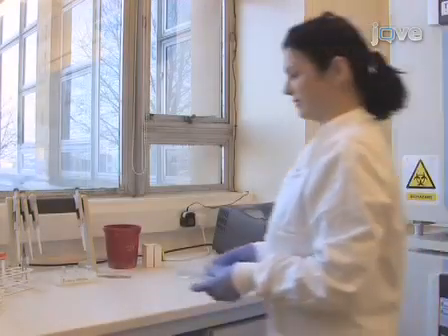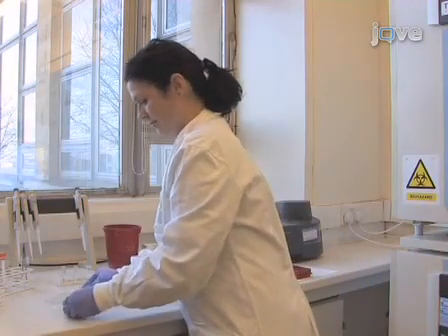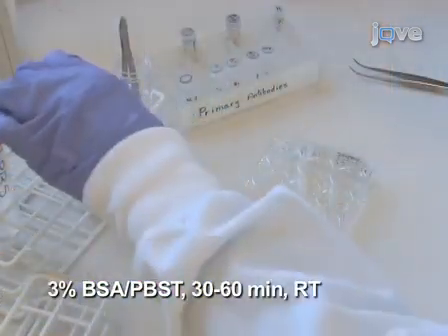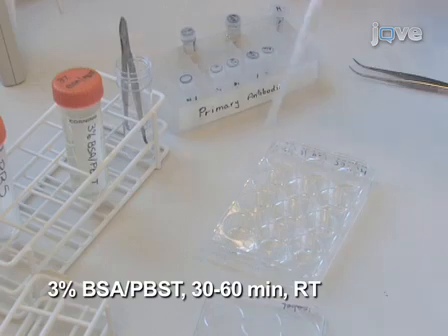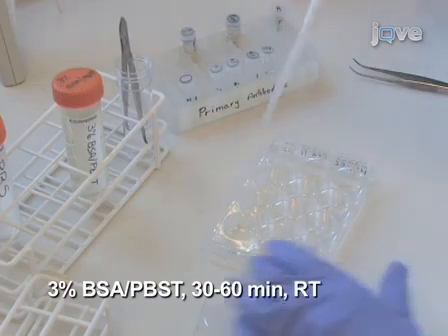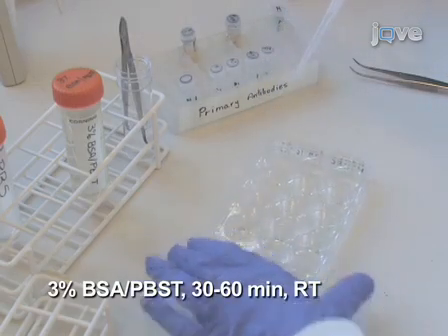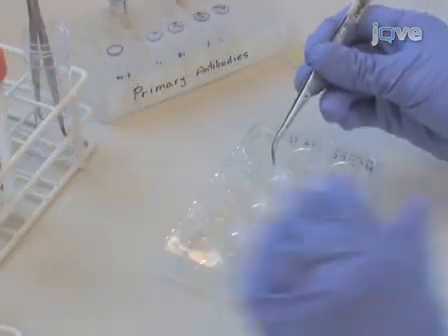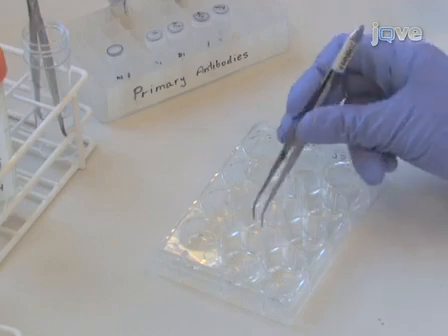Staining of intracellular bacteria and α-actinin can be performed simultaneously in 12-well plates. Block the cover slips containing the permeabilized cells with 500 microliters of 3% BSA PBST for 30 to 60 minutes at room temperature. After washing with PBS, transfer each cover slip to a new dry well in the 12-well plate.